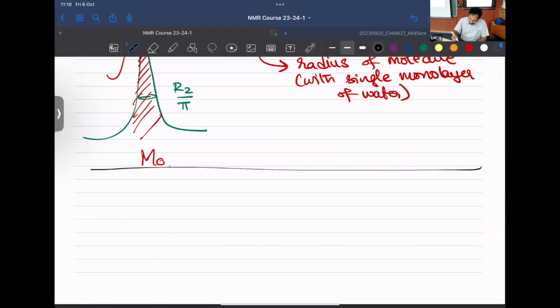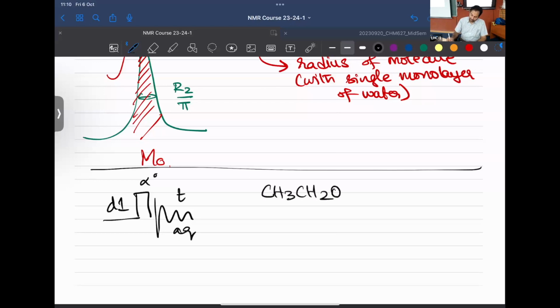Let's recapitulate what we did. We were looking at how a pulse program looks at the spectrometer. If this is a one pulse experiment where an FID is acquired for an acquisition time AQ, for a given D1, we were looking at signals that arise from different NMR experiments. So far, we saw ethanol in D2O. This is what we saw yesterday.